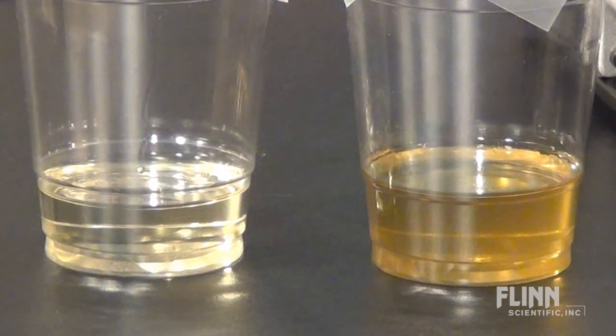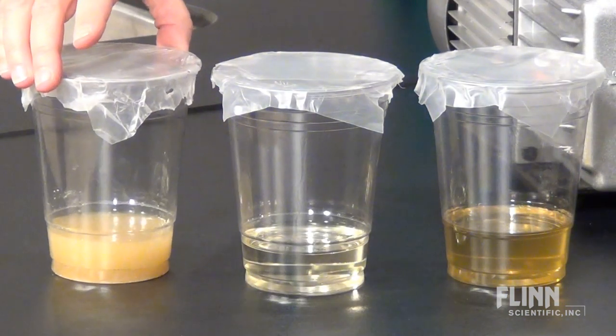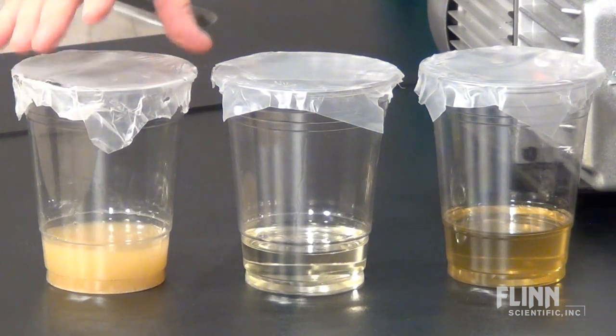The color may change after a few uses, but the oil should still be clear enough to see through. If the oil appears cloudy or has black flecks in it, it's time to replace it.